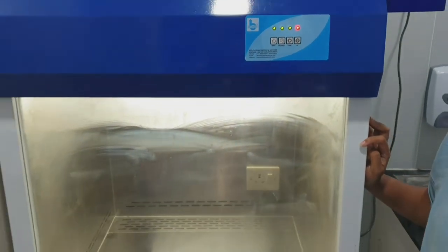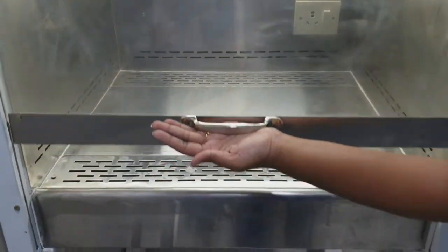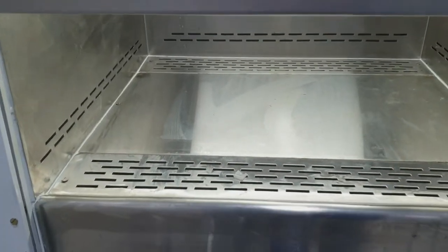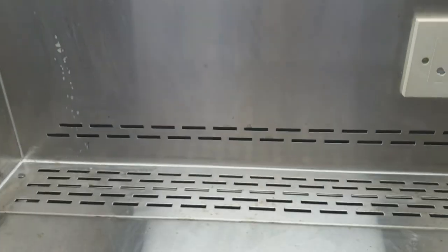Turn on the tube light when the person is working here, and you have to lift this viewing window and work inside. This is the viewing window. Usually once the hand is inside, you have to lower it down and then work only with your hands.